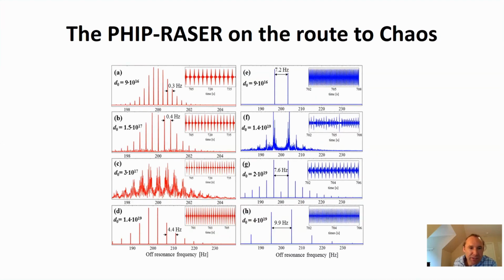So in these simulations, what we show is that at very, very high polarization levels, that's A and E, you can get these frequency comb effects. And then as the polarization goes down, a little bit lower, you can get into this regime where you get crazy chaotic behavior, all kinds of frequencies coming from the system.